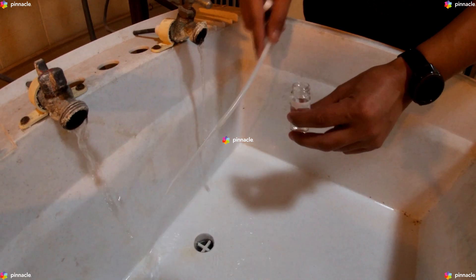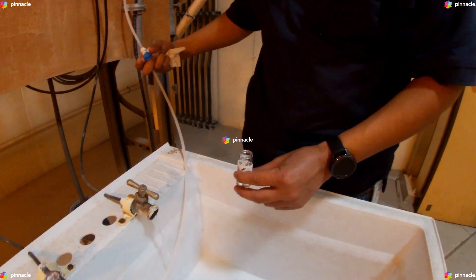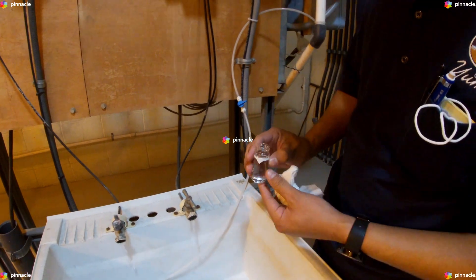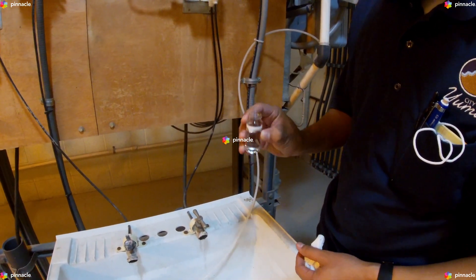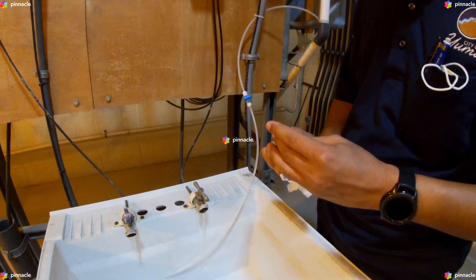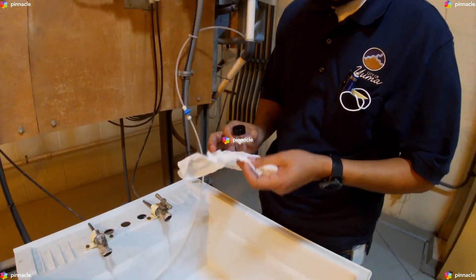Now that our sample line has been flushed, we will prepare the blank. We will fill the sample cell with 10 milliliters of sample. We will clean the prepared sample cell.